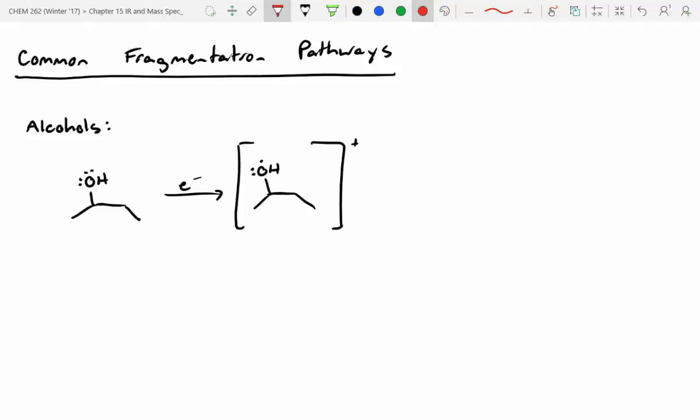The carbon with that oxygen coming off is alpha. And the carbon one away is going to be our beta carbon. And then what do you think the next furthest carbon away is? Gamma. So we like to label these as alpha, beta, and gamma carbons based on their positioning relative to the functional group. And this radical is pretty dang unstable.